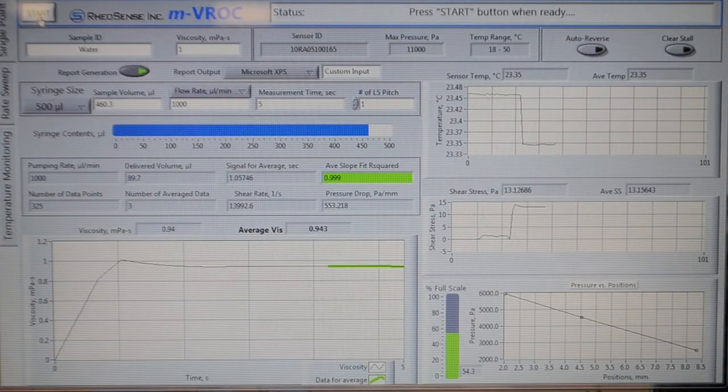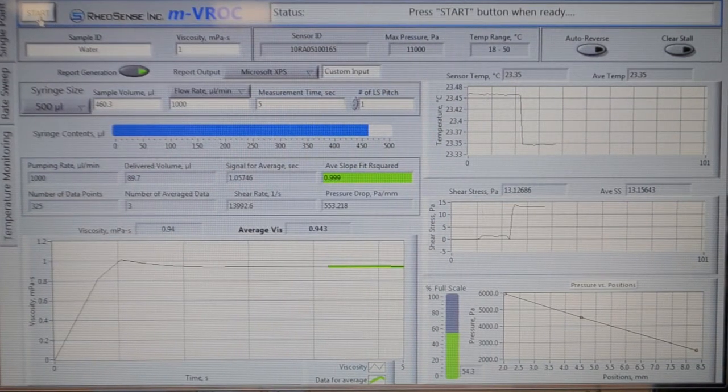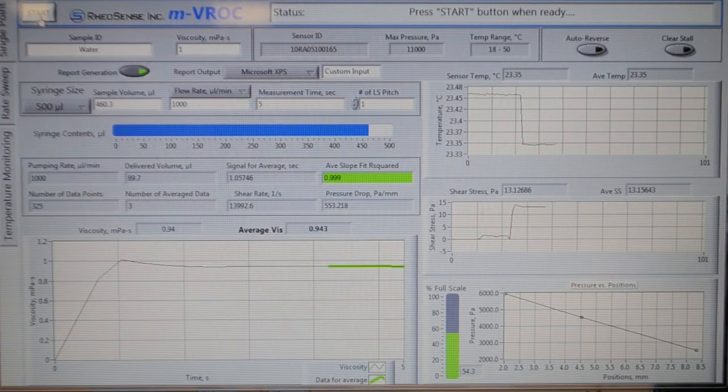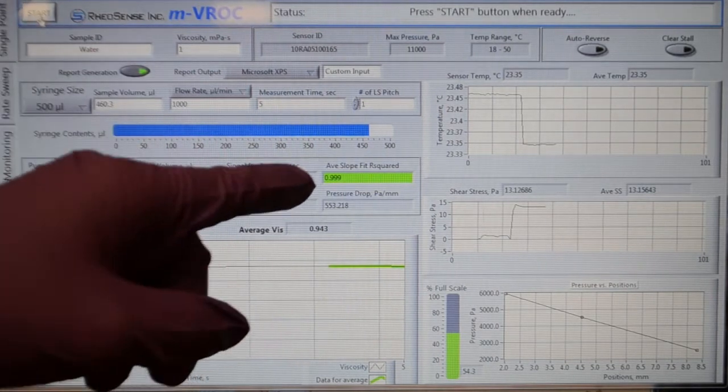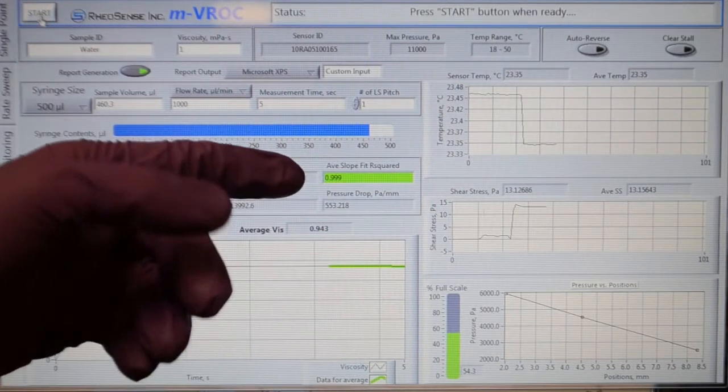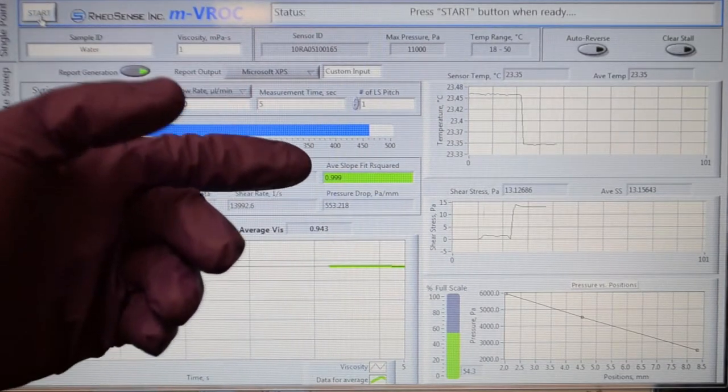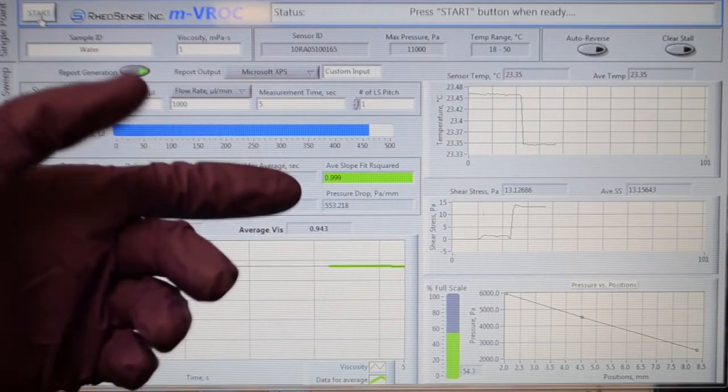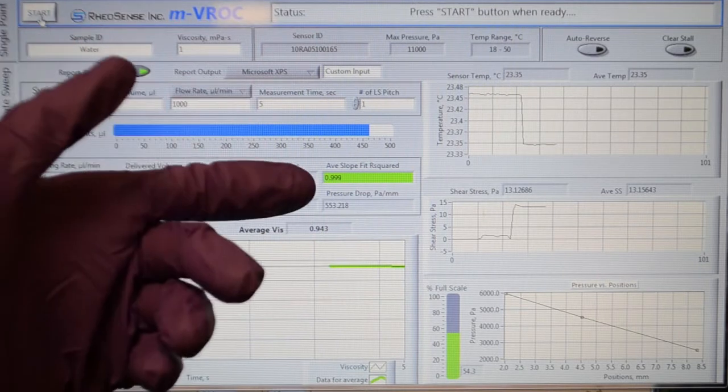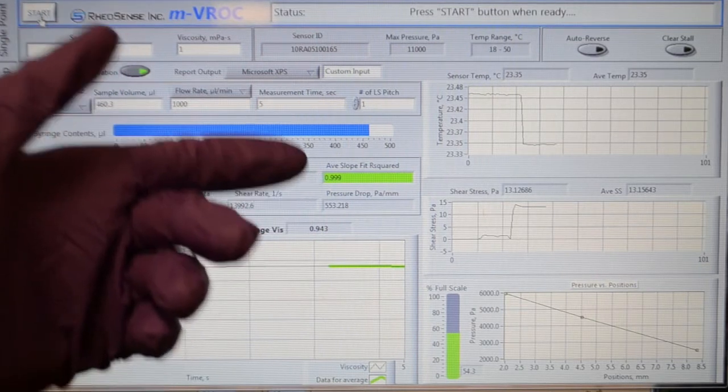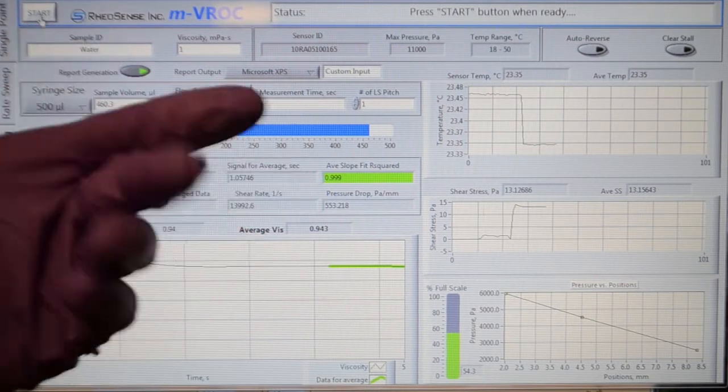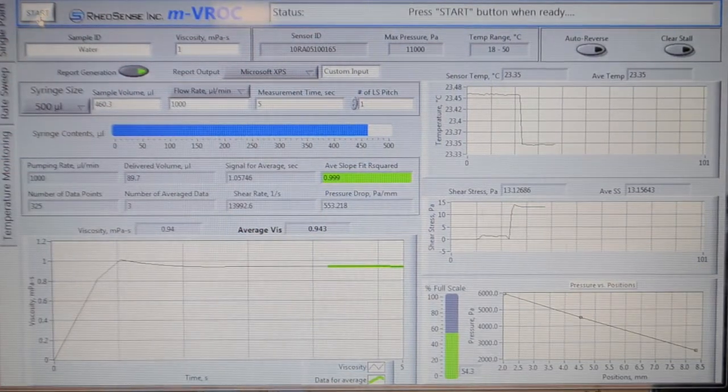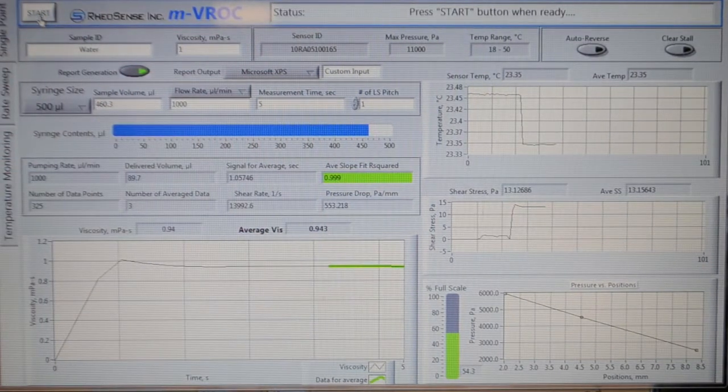Your R-squared values will be represented in the program as average slope fit R-squared. Look at this value after your run. If it's less than 0.999, then you need to repeat your sacrificial run.